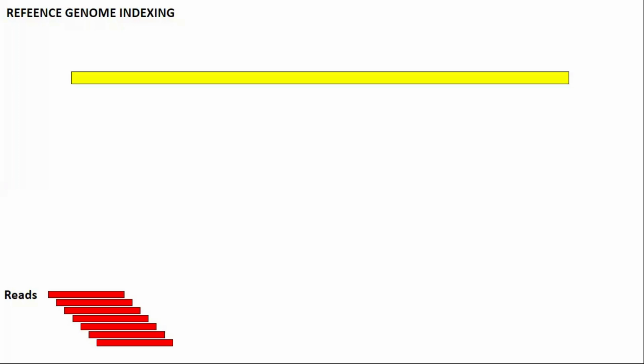So I think you have got the point of why we perform human reference genome indexing. Okay, so this is the main logic behind it. In order to make it efficient, effective, and computationally less extensive, we perform genome indexing. There are multiple tools that perform genome indexing: the STAR tool, the Bowtie tool, STARsolo, Cell Ranger. These are the different Linux tools that perform genome indexing.